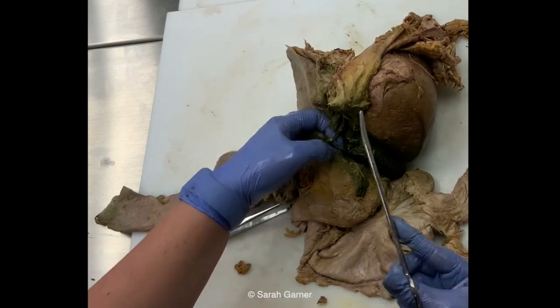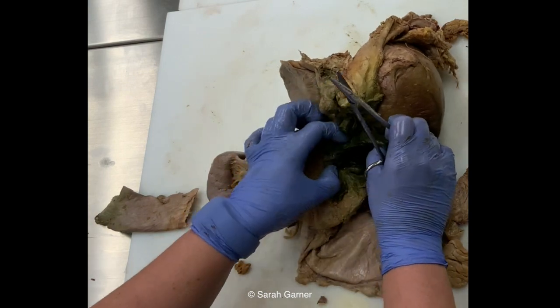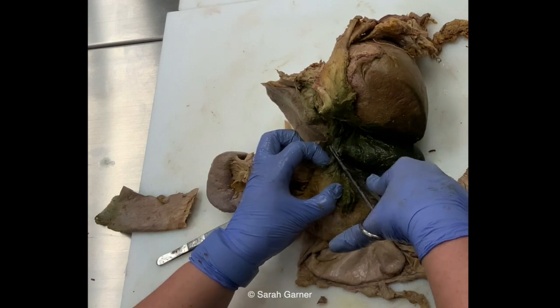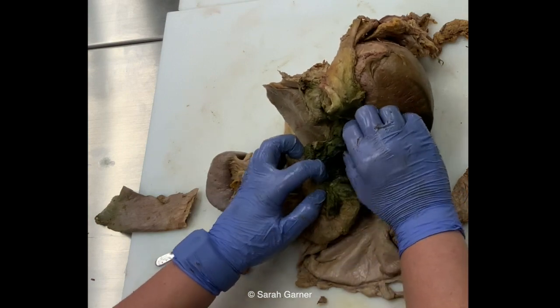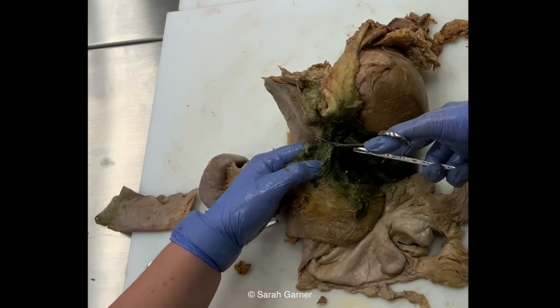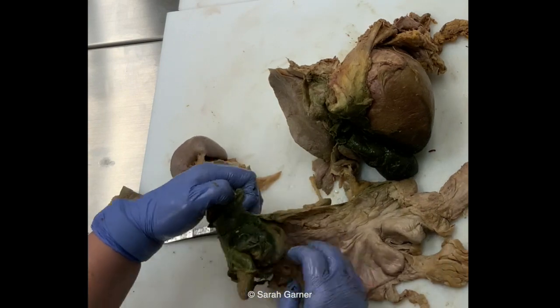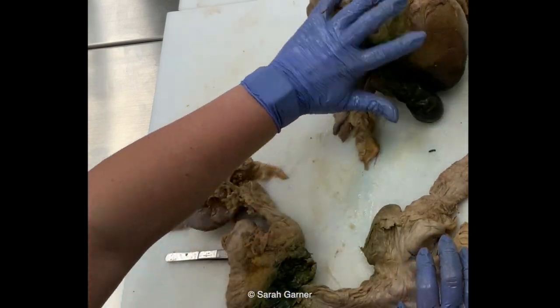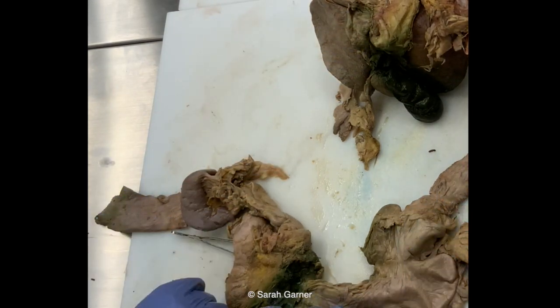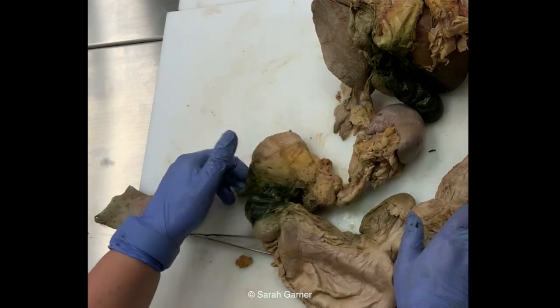So I'm cutting across the hepatic portal vein here, cutting the rest of the proper hepatic artery. And with the bile duct, I'm gonna choose to leave the gallbladder attached. So I'm gonna cut across the common bile duct there. And then this is just connective tissue, so I can go ahead and cut that. Okay, so now we have liver, gallbladder, and inferior vena cava. And then we have esophagus, stomach, duodenum, pancreas, spleen. So we have those separated, okay?